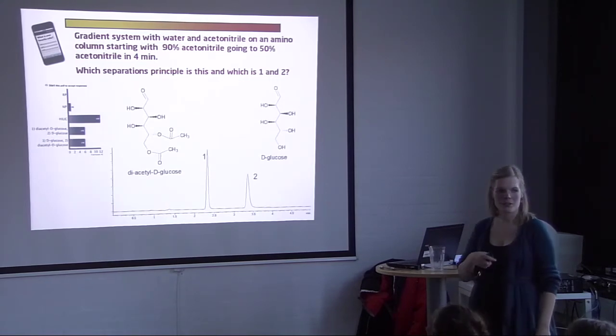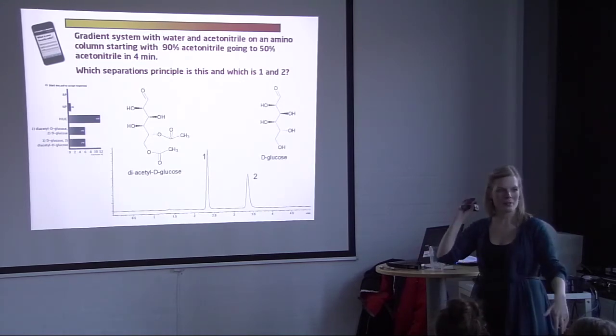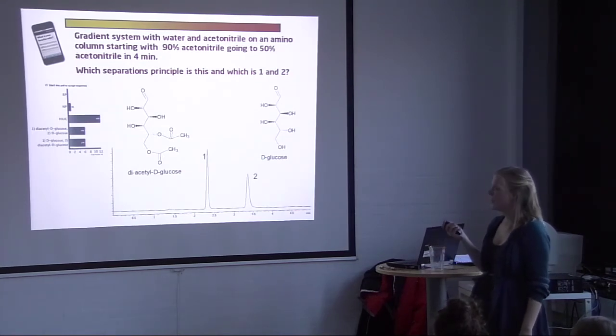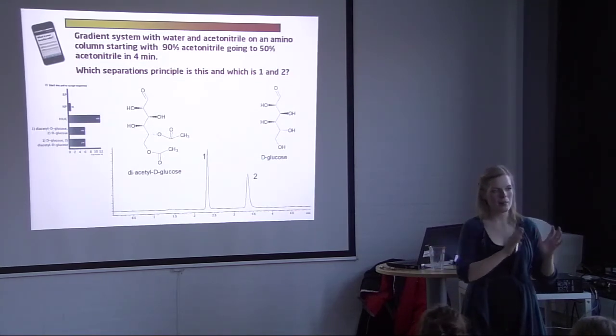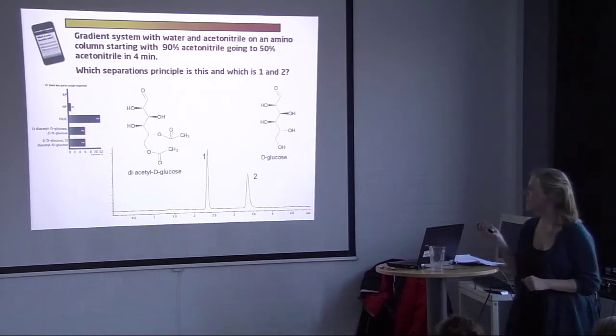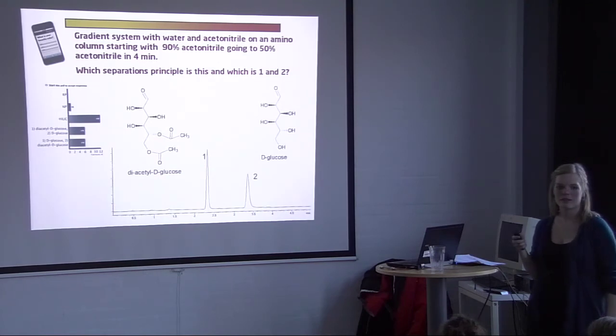This is because we have both polarity of the compounds and polarity of the stationary phase, and now everything is confused. But in HILIC, we got the apolar compounds coming out first. And which of these two is the most apolar one? Come on. Front row.